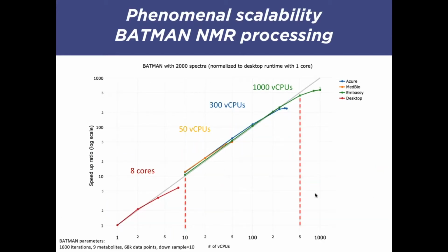So I mentioned that you can easily scale with PhenoMeNal, and this is an exercise that our partners did at Imperial College London, where they installed the PhenoMeNal setup on different sets of machines, in different clusters, if you want. They started with a small desktop computer that had 8 cores.